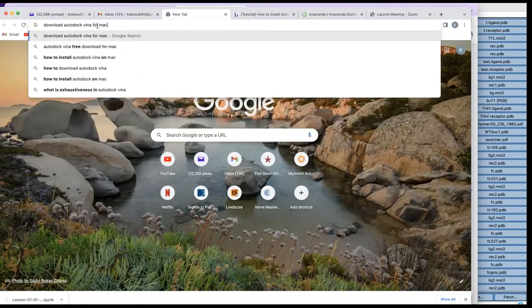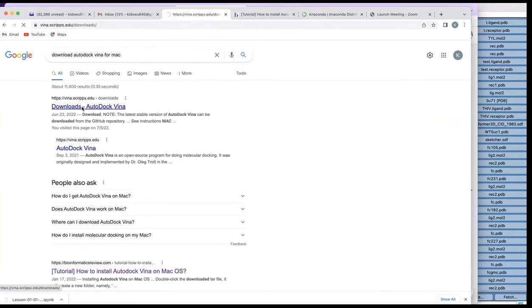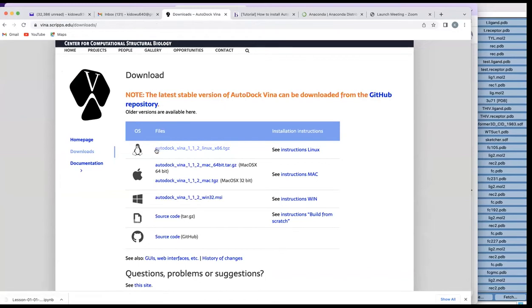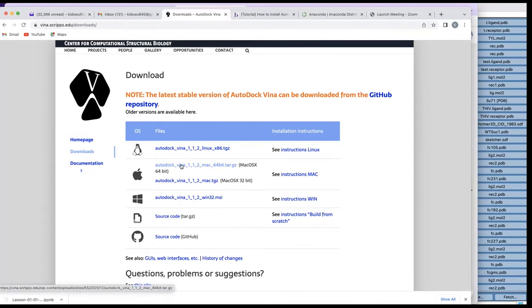Search 'AutoDock Vina for Mac,' click enter, and the first result will be the download page. Click on it and you will see options: there is one for Linux, and we also have one for Mac. For MacBook we have 64-bit and 32-bit, so you need to determine whether your Mac is 32 or 64-bit. There is also a source code option. Download AutoDock Vina for MacBook — you can see I've successfully downloaded it.